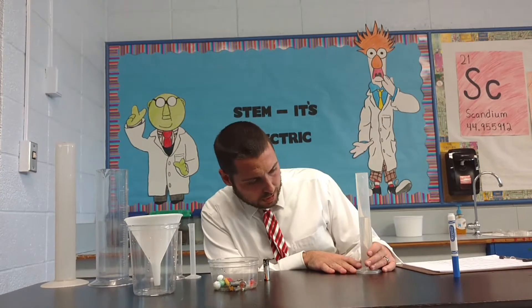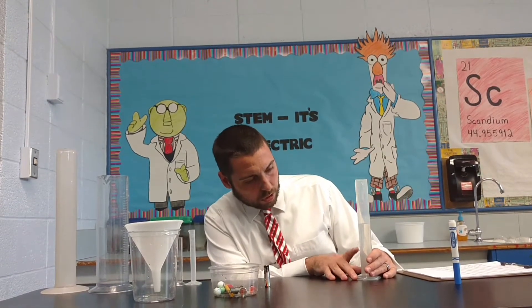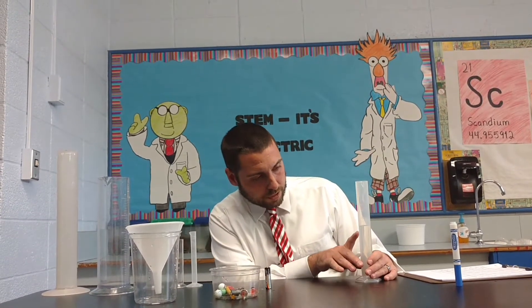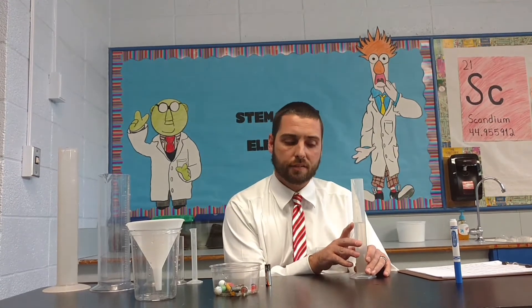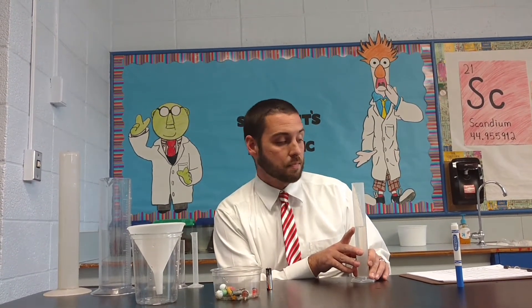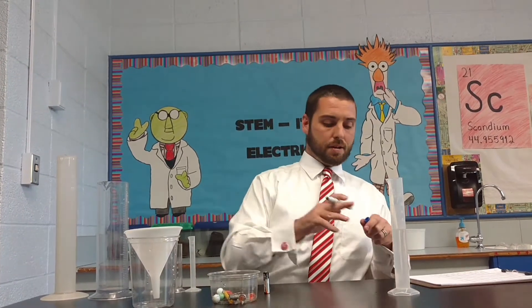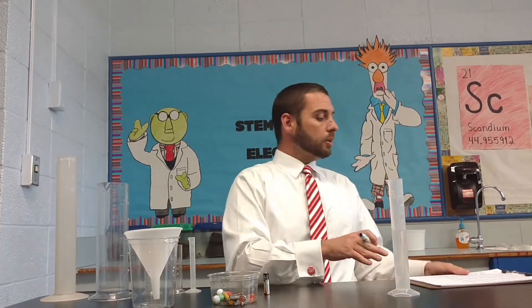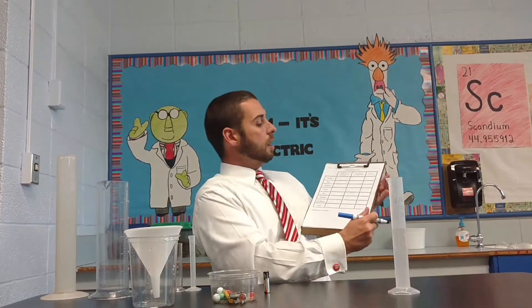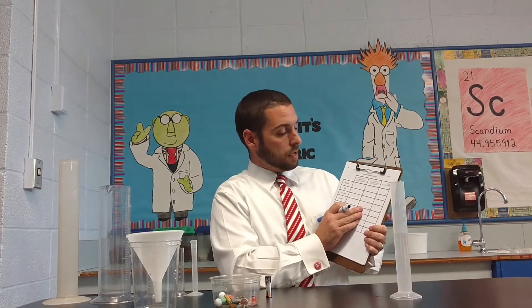I'm going to examine my graduated cylinder. I start down here and I got 10, 20, 30, 40, 50, 60 — it is smack dab on 70 milliliters. So we're going to take that information and record it upon our data table.